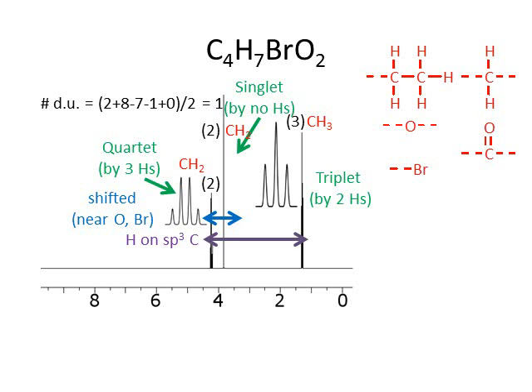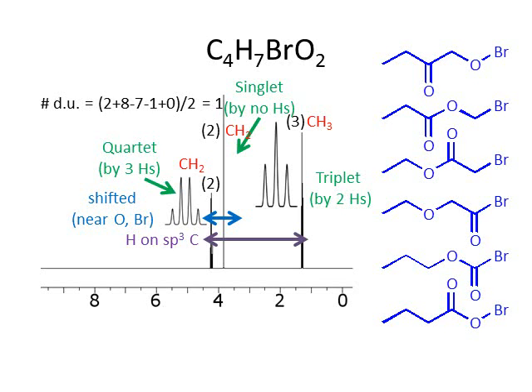And now notice I've got 2 things that make 1 connection and 3 things that make 2 connections. And that's going to help because I got 2 things that go on the end, and then I got 3 things that connect in between them. Okay, those are my pieces. That's all the atoms in my formula. But I can string those pieces together in a variety of different ways.